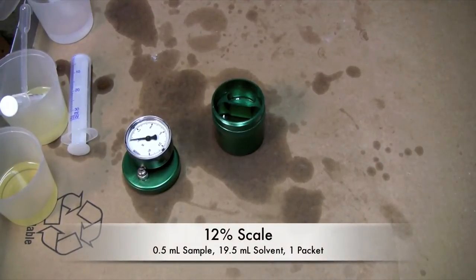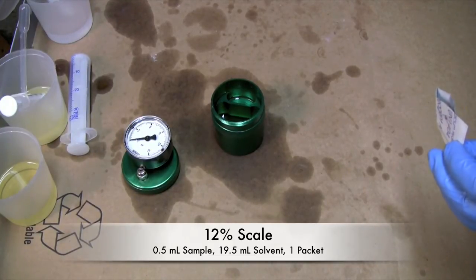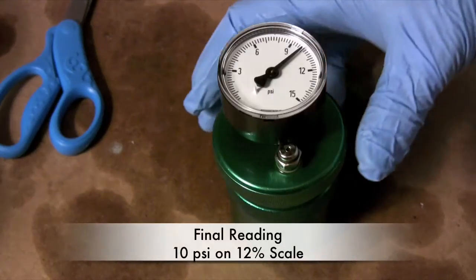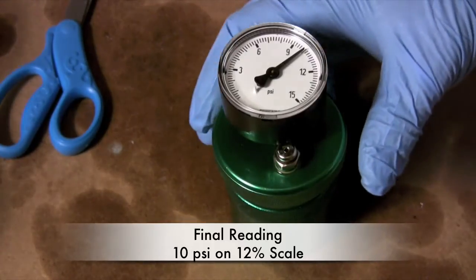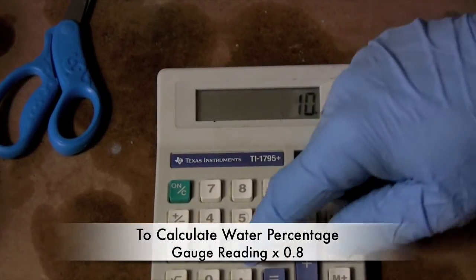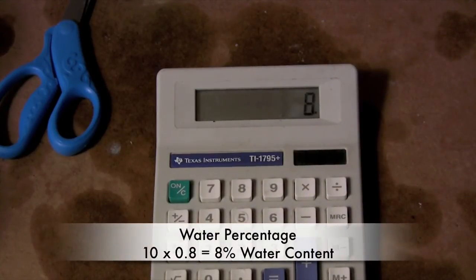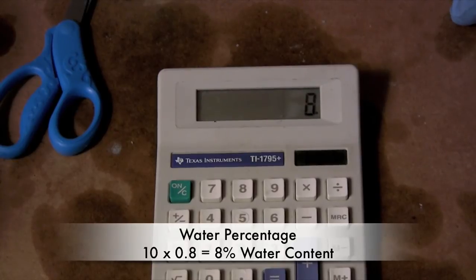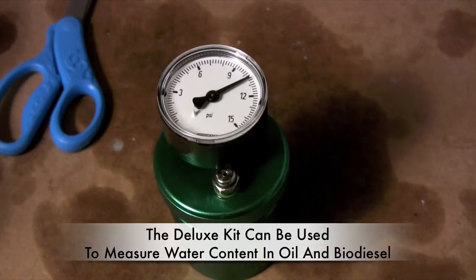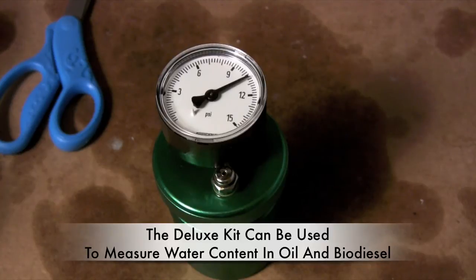We're now on the 12% scale. We've added a half a milliliter of sample and 19 and a half milliliters of Reagent B, and I'm just about ready to put the Reagent A in. The scale on our water test kit came out to 10 PSI. The way the equipment says to figure that out is you take 10 and multiply it by 0.8 — that's 8%. So our oil had 8% water content in it. Using this water test kit you're able to test several samples of oil and find out what your water content is. Had we used this oil to make biodiesel, we would have made an awful lot of soap.